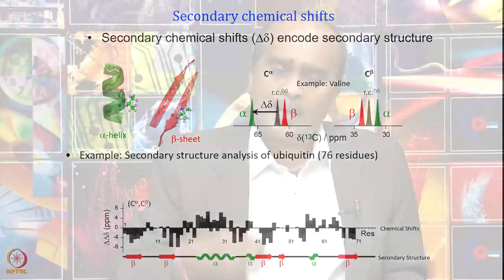So you see, by doing these experiments we are all the way arriving at the secondary structural information using solid state NMR techniques. Okay. So, here I will stop by giving you the impression that solid state NMR can be used for structural determination. I will go into a little more detail, show you the pulse sequences in detail, how you can use those strategies for resonance assignment in solid, and how you can get the structural parameters for getting the structural information as well as the dynamic information in the next classes.